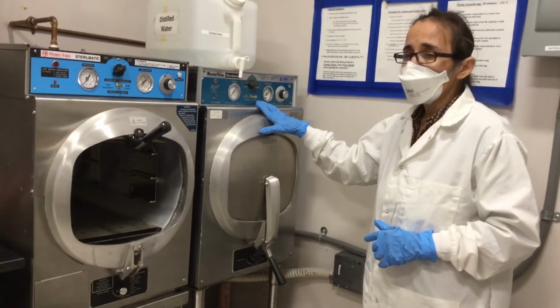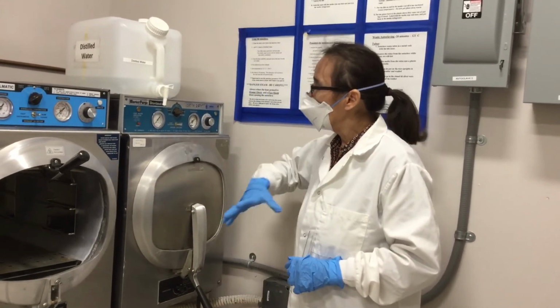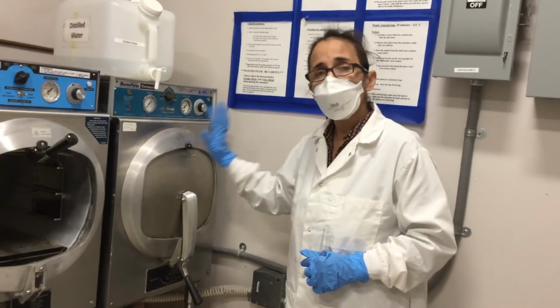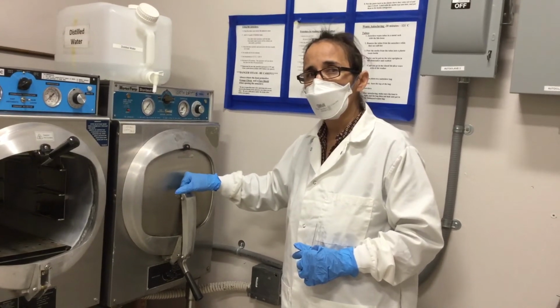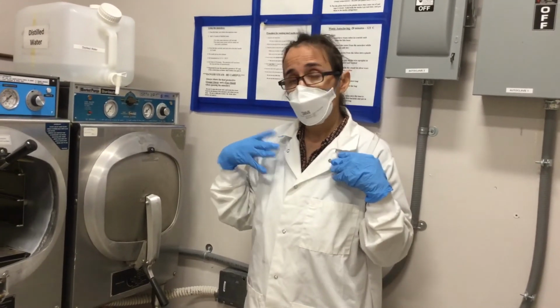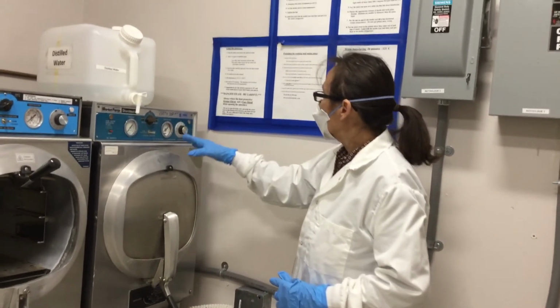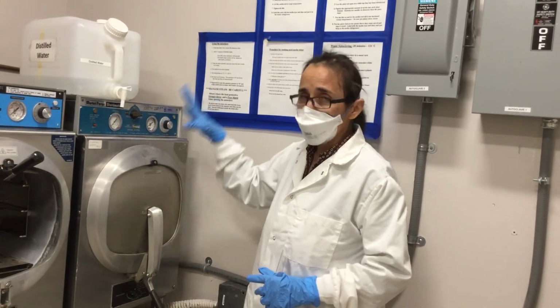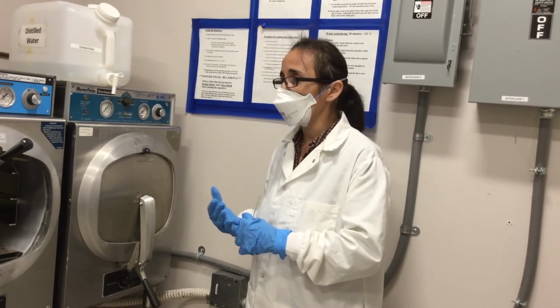And in the slow exhaust, it will take around 1 hour after you sterilize the material to completely depressurize the system. You cannot open this machine when you still have pressure in the chamber. First, you cannot open it. If you try to open it, it's not going to let you. And if you force it to open, all that pressure, all that vapor is going to go into your face, and it's going to burn you. And once this is done, once the pressure is at zero, once the temperature is lower than 160 degrees Fahrenheit, then you can open it. And then you have to have your thermal gloves in order to open it.